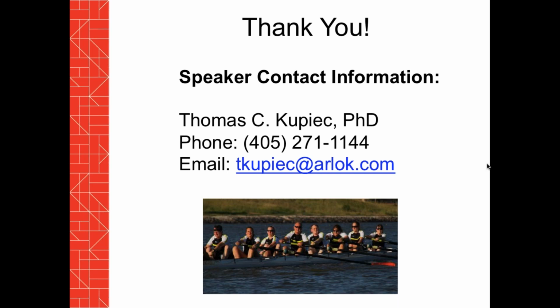Thank you. In the case of non-sterile compounding, when is it appropriate to conduct USP 51? During your formulation development, and the guidance is good for anything that's multi-dose, a drug with a preservative in it. You want to be sure and verify that the preservatives are going to do their job, and that's exactly what the USP 51 test is designed to do: ensure efficacy of the preservative throughout the time you want to store it or the patient might use it.